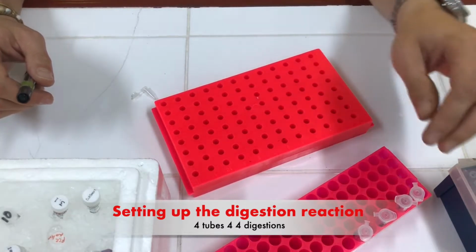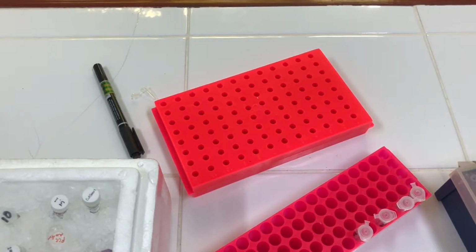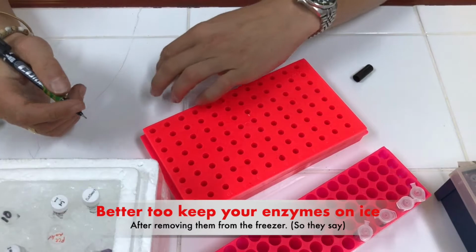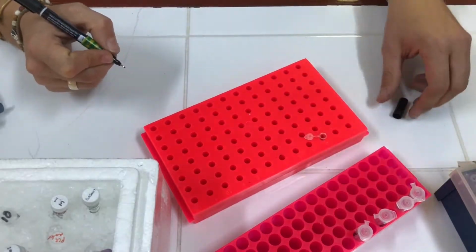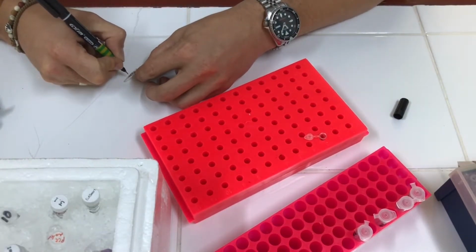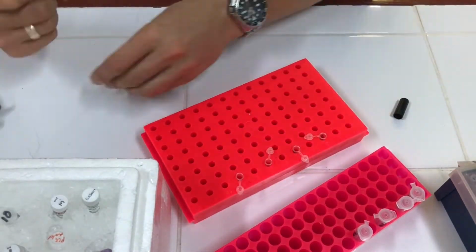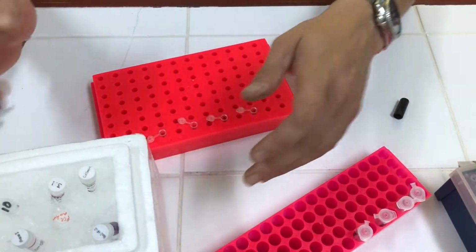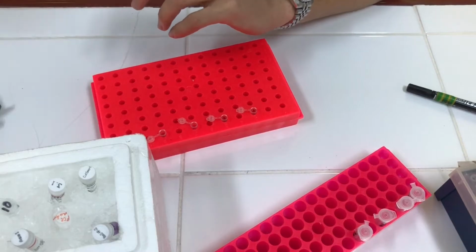Okay, so now I'll be writing on the tubes. I should have a control for PUC, but sadly I don't have DNA for PUC18.